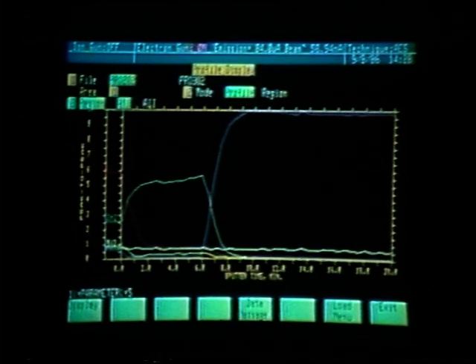What we would like to do is obtain a copy first of this graph. Then we would like to obtain an atomic concentration. But let's keep in mind that in that atomic concentration, we do not want the silicon peak to be included in the atomic concentration calculation, silicon being region number 5.